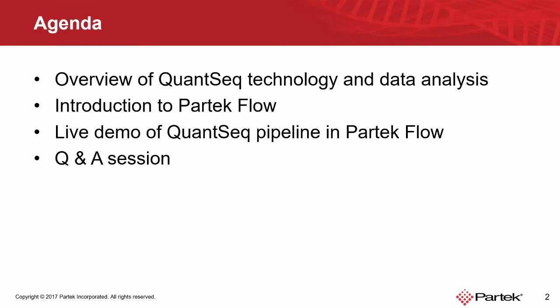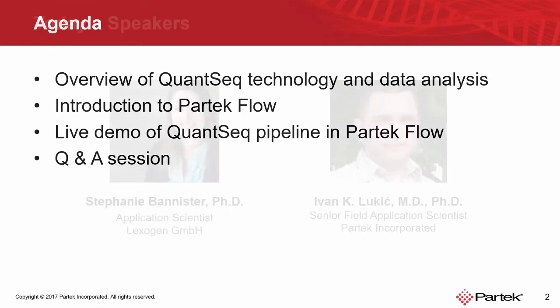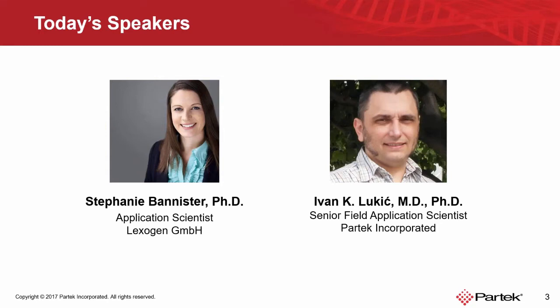Without any further ado, it is my pleasure to introduce Dr. Stephanie Bannister from Lexogen. Stephanie is an application scientist at Lexogen. She provides technical and application support to Lexogen customers and develops technical resources for Lexogen RNA sequencing products. Stephanie received her undergraduate degree in biotechnology from Deakin University, Australia, and her PhD at the University of Melbourne, Australia. Her core scientific experience encompasses molecular biology with a focus on microRNA regulation, RNA interference, and genome editing, and reproductive biology in chicken embryos and marine polychaete worms.